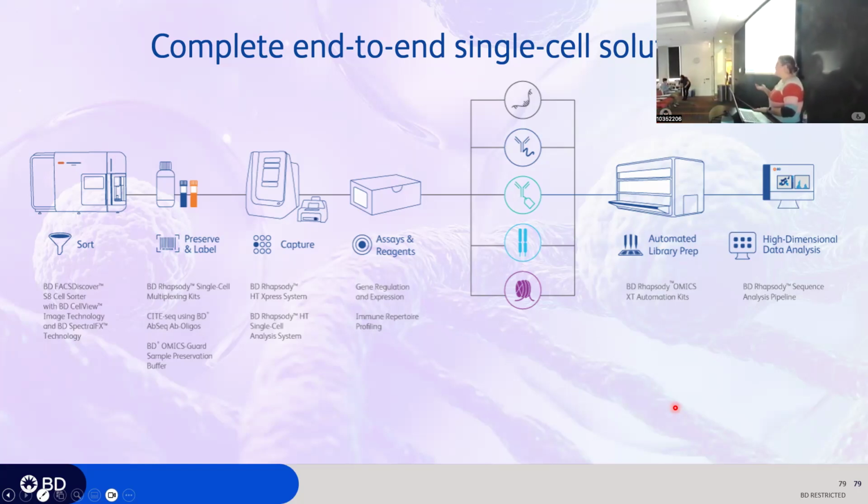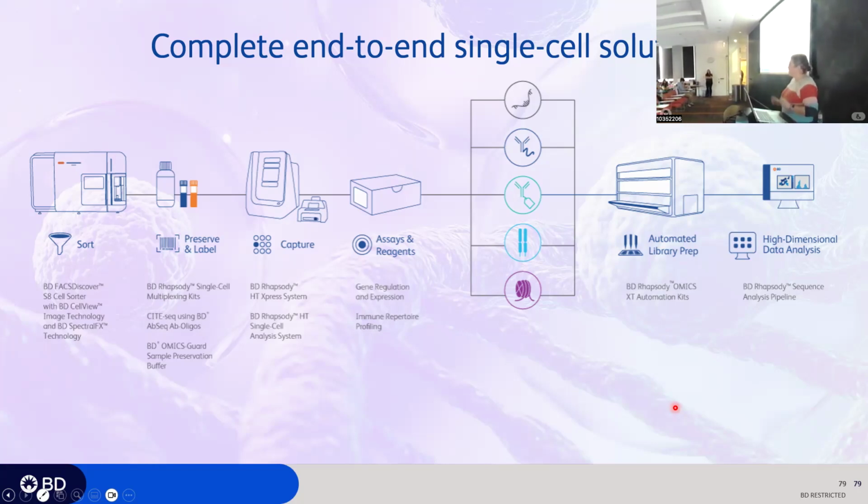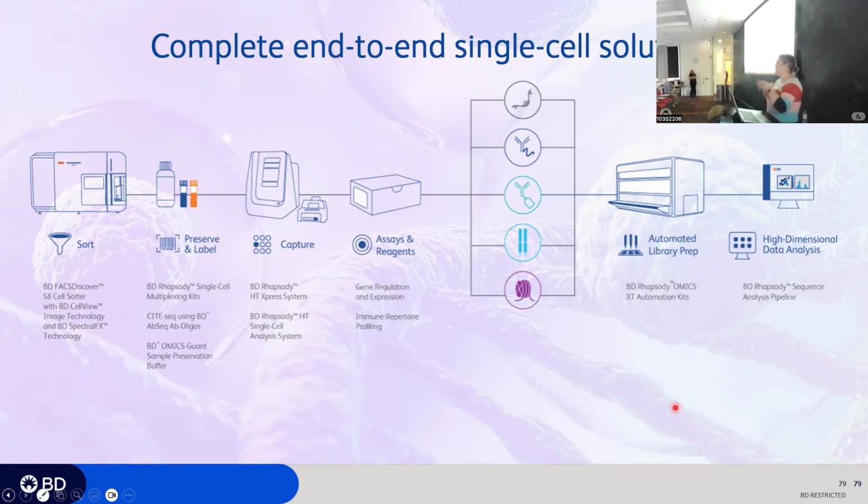It is very similar, and I think, in fact, we share the IP for the barcoding on the beads. So our poly A capture is very similar to theirs at the chemistry level. It is the cell partitioning itself that's different.